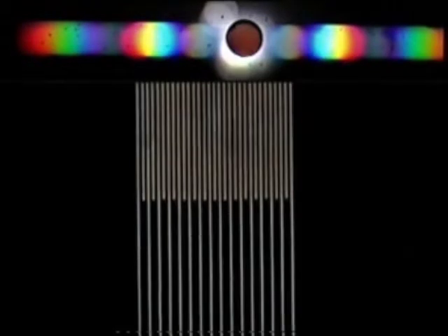When you have in the positions of those lines a double dose of light, light taking the diffracted route together with light taking the zero order route, then those two lots of light, the diffracted light on the one hand and the zero order light on the other, interfere and give us the black lines.